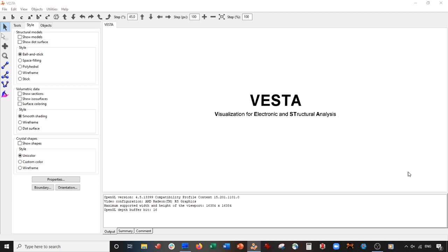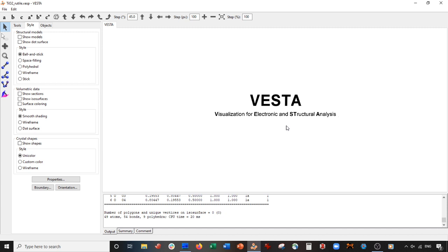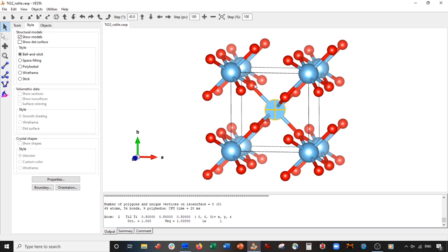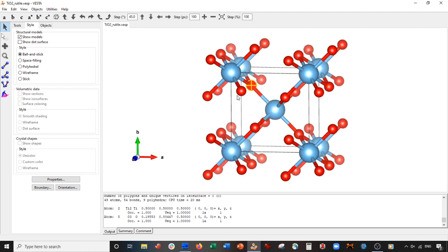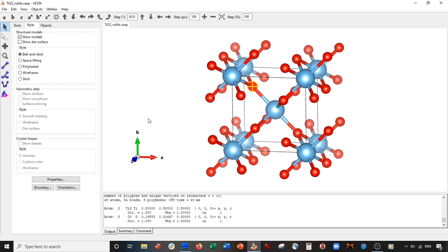Let's get started. I'm going to start by opening a unit cell for rutile titanium dioxide. Here we have it where the titanium atoms are these blue atoms and the oxygen are these red atoms. The first thing we're going to have to do — and if you see my other videos on this please go check them out, I do this for calcium fluoride and also for gold — is we're going to expand the crystal using the boundary method, not the transform method.